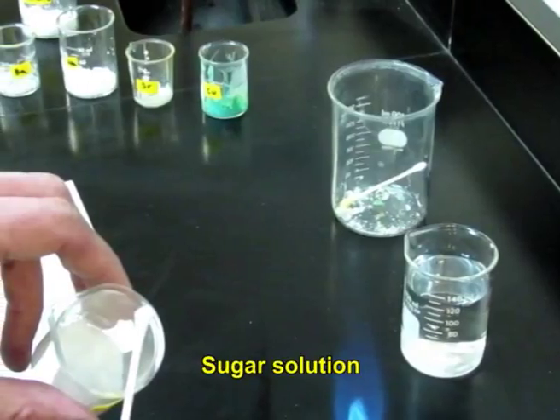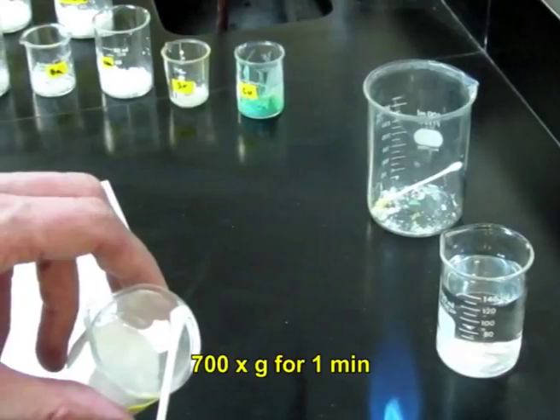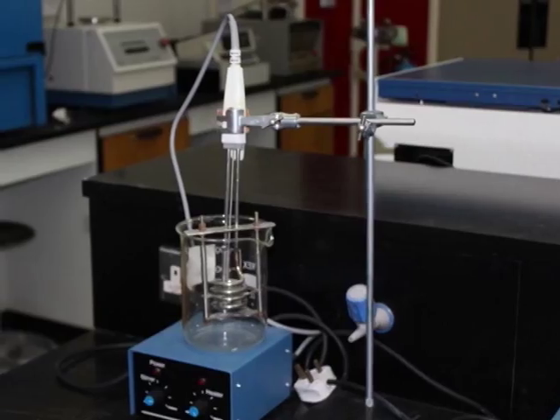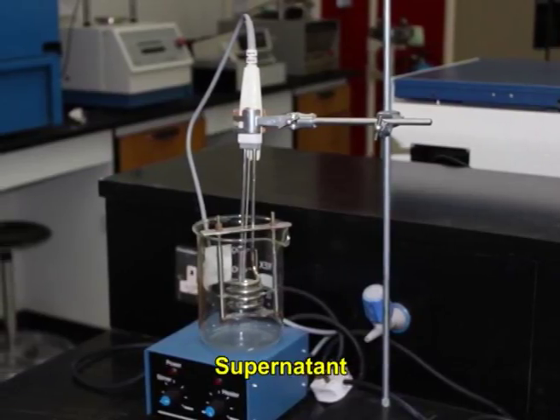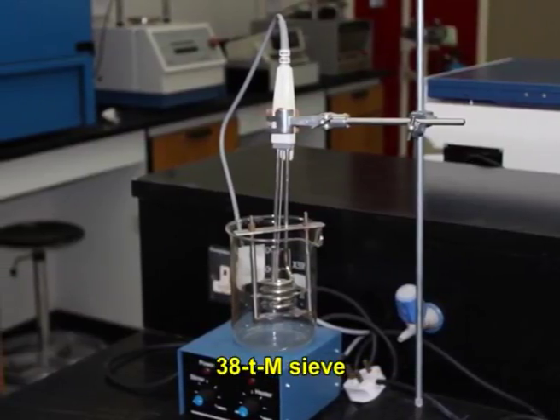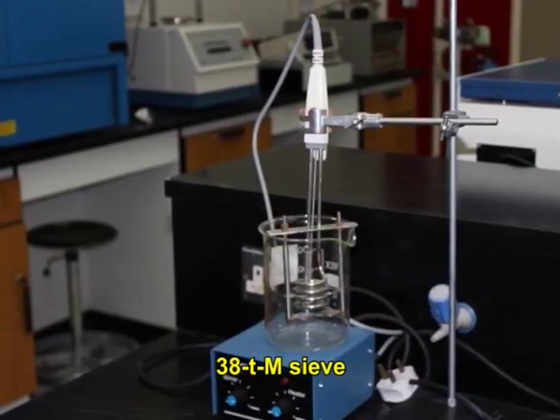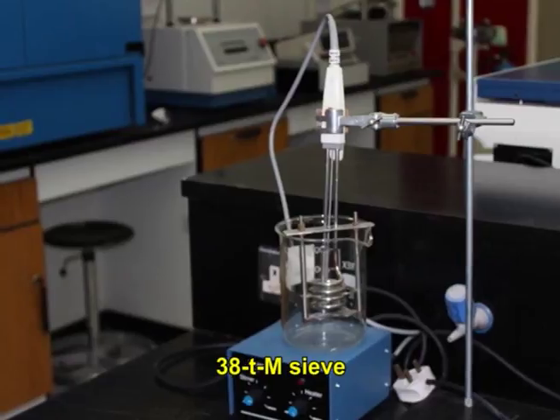Again the sugar suspension was centrifuged at 700 rpm for 1 minute. After the second round, the supernatant was decanted and passed through a 38 micrometer sieve, and the nematodes were collected by backwashing from the sieve and counted.